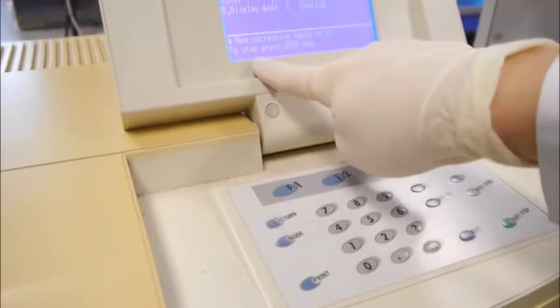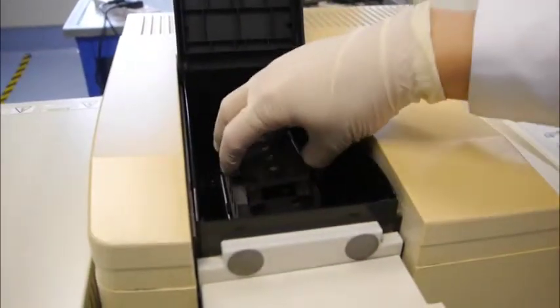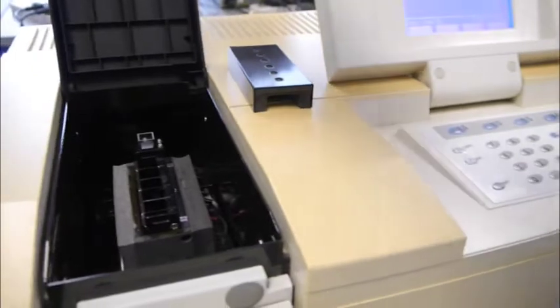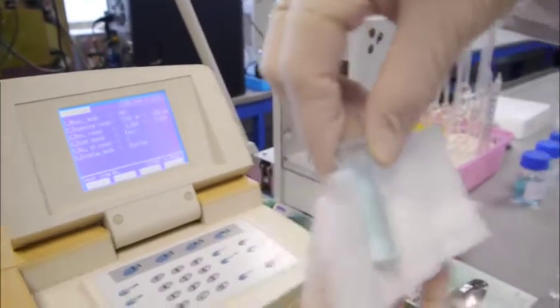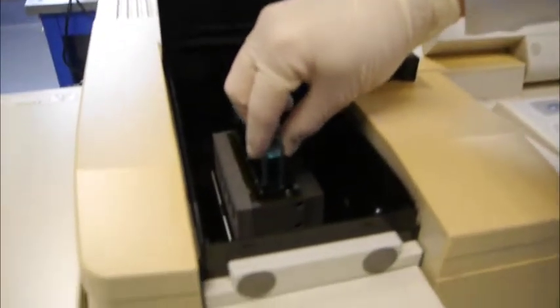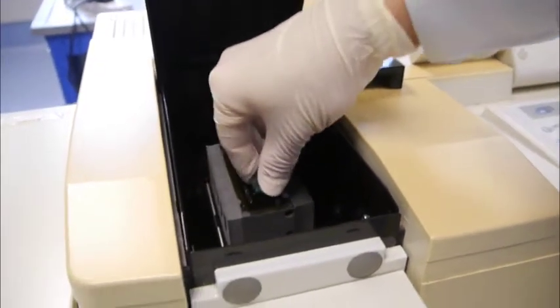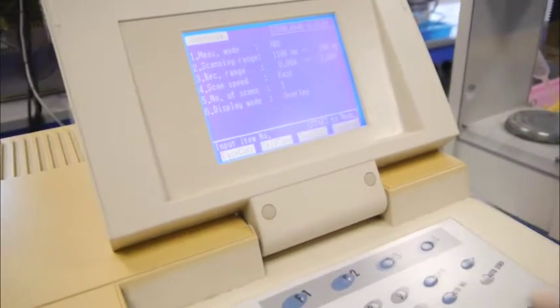After which you will press F1 to do a baseline correction. After the baseline correction has been completed, we will have to take out the cuvette from sample cell 1. After we have done that, place the middle range concentration standard solution into sample cell 1, sample cell holder number 1. Then cover with the cap and we will do a scan by pressing start.